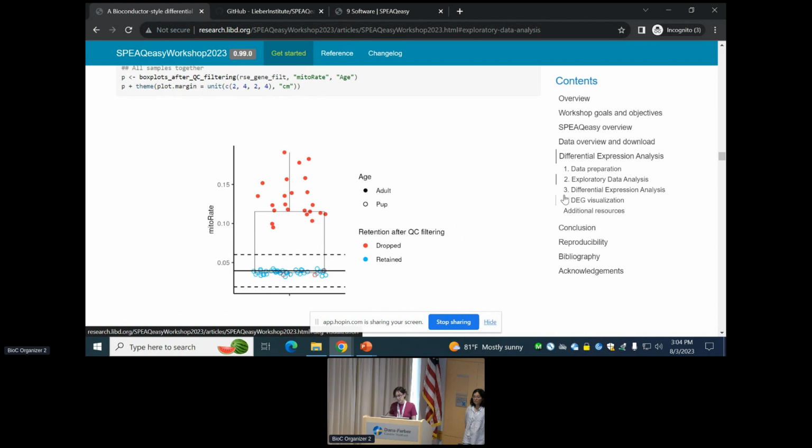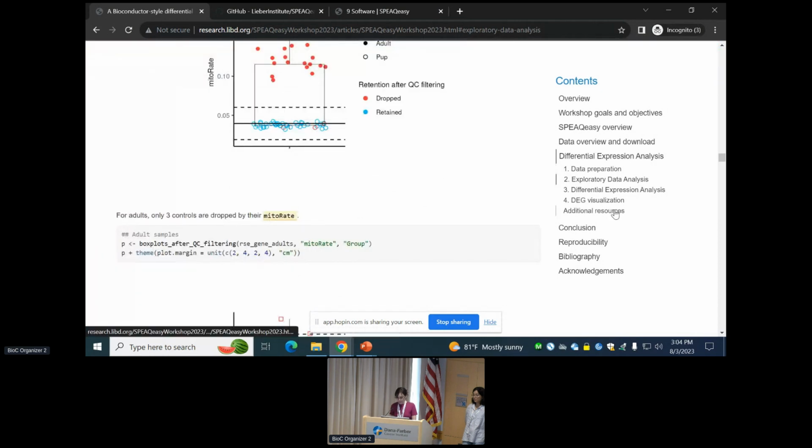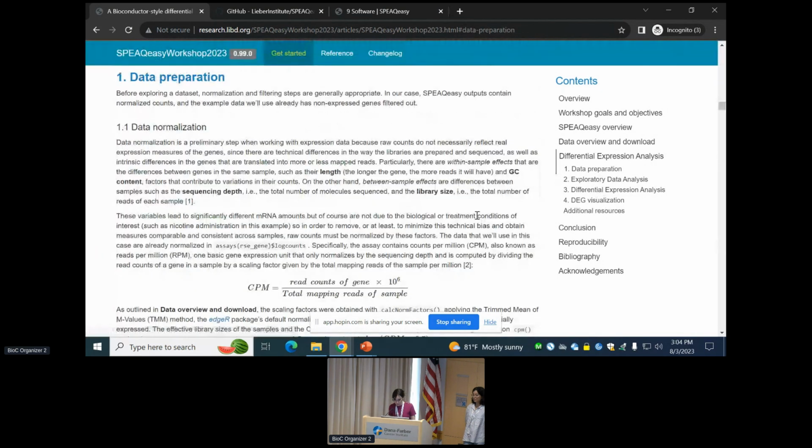Yeah, we had the question in our pre-conference workshop, where we talked about outliers: can you computationally detect them? And I'm like, when you've got 3 replicates per group, no. So I just thought that was interesting. I didn't quite follow all the stuff about the partition of the variation. Even after doing a voom correction or something, you still see effects of sequencing depth on the resulting gene expression. Yeah, we can see that here.